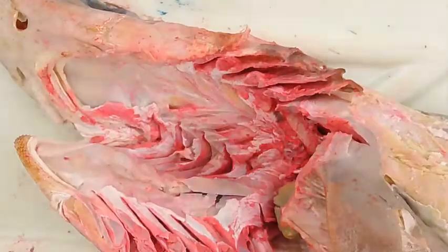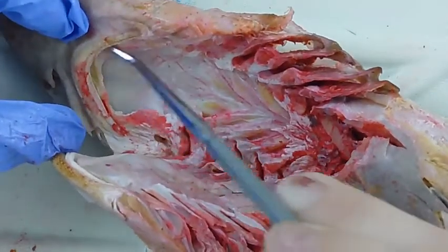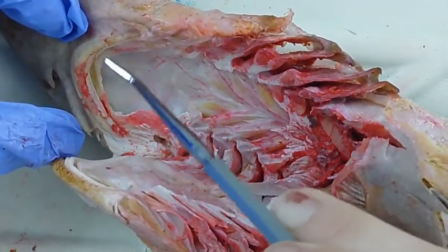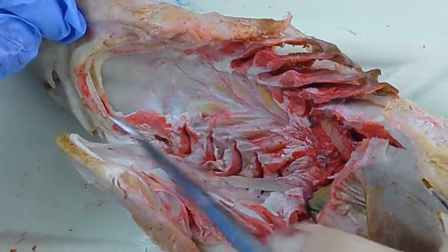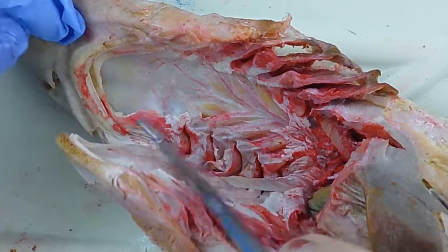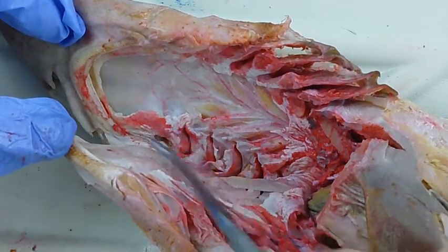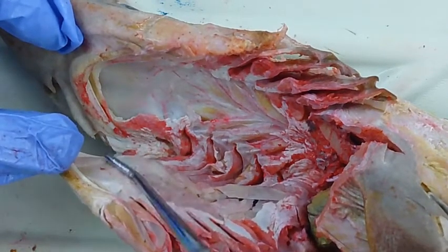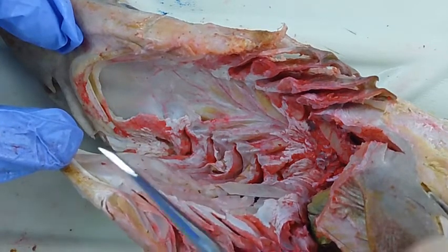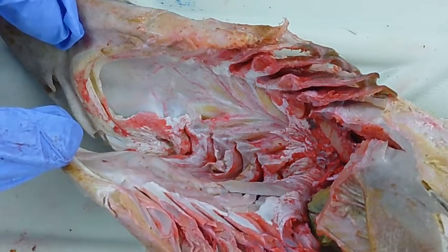So, to start, we have 2 rows of functional, triangular, serrated, polyphyodont teeth. And then the oral cavity here extends from the lingual surface of the teeth to the level of the spiracle. The hyoid arch supports the oral cavity, and the raised floor here of the oral cavity is the tongue, which isn't a true tongue because the structure does not have muscle.